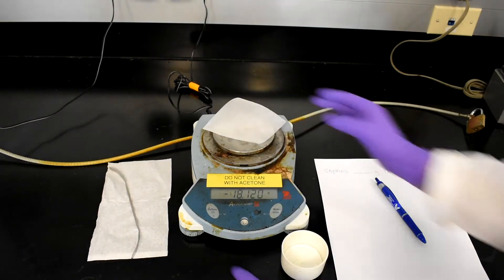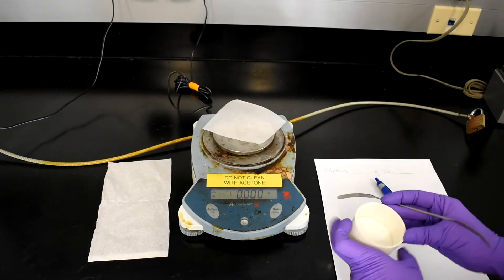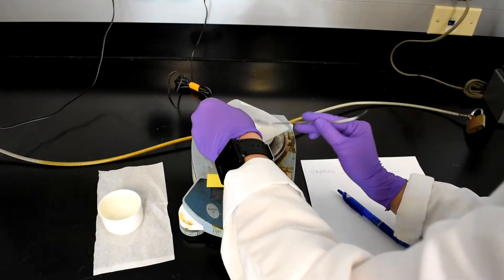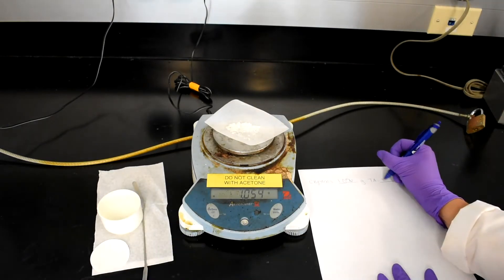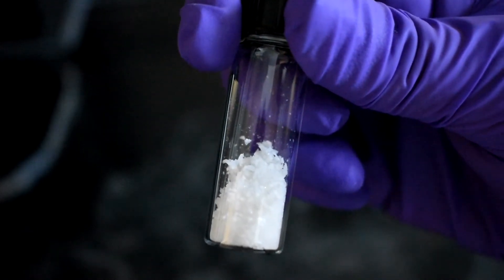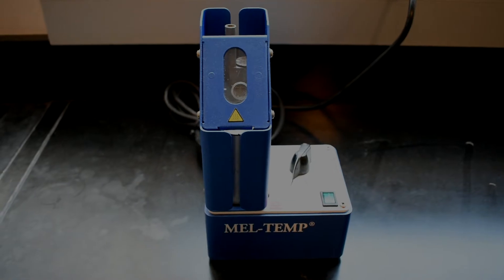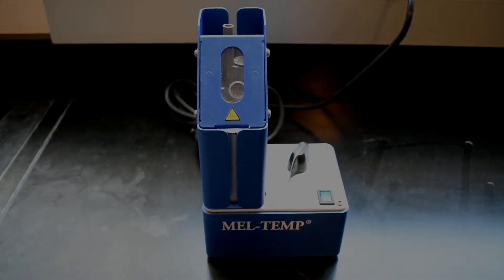After the crystals are dry, tare the scale and weigh your crystals. Make sure your TA is present to sign your practical performance report. Place your crystals in a vial for further analysis and to submit to your TA. Next, take the melting point of your product using a Meltemp. You should look up the melting point of your product before coming to lab so that you know what temperature range you're aiming for.